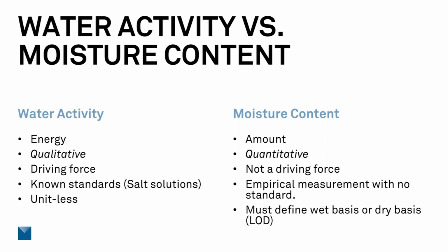proven empirically. We've been able to take that one step further and make unsaturated salt solutions that have a known water activity as well. They're also based on theoretical equations, concentrations, and density, but are less susceptible to issues that make saturated salt slurries difficult. If you've ever tried to make one and finesse them so that they get to the level you want, then you know that it can be a little tricky.